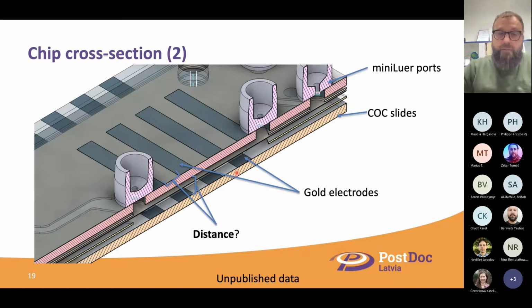Going to the details, there is a third parameter which is very important for my chip: electrodes. These are electrodes not only for treatment of the cells which we are growing inside the chip, but also to use as a transepithelial resistance measuring system. So the same electrode will be used for both PEF treatment and for TEER measurement.